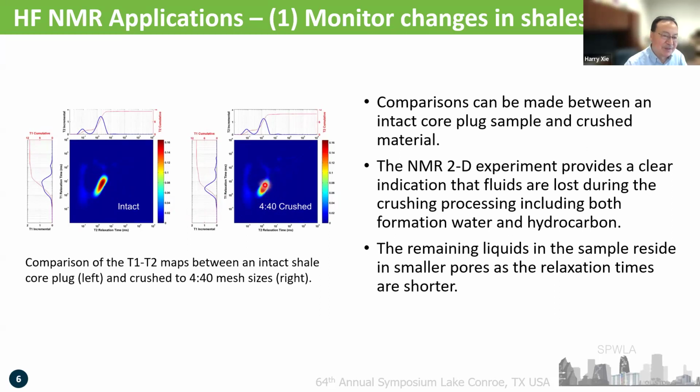So when people are doing the crushing, you're going to question them, okay, what do you want to do with the crushed sample? If you want to measure saturations, your saturation changed. And also when you do saturation measurements, if a sample is not fresh, what you measured is the saturation at that point, not the saturation downhole. So that's an important message we get from here.